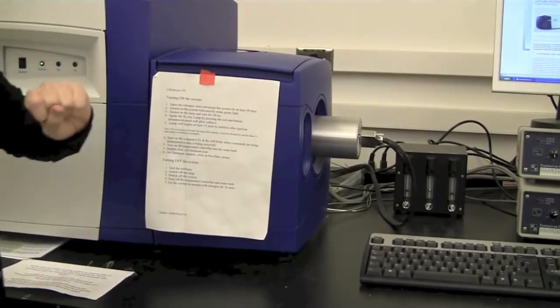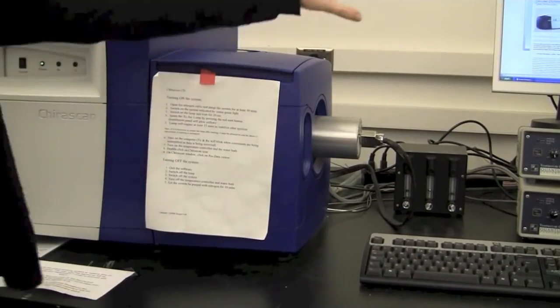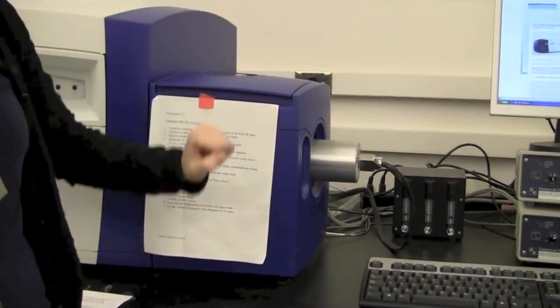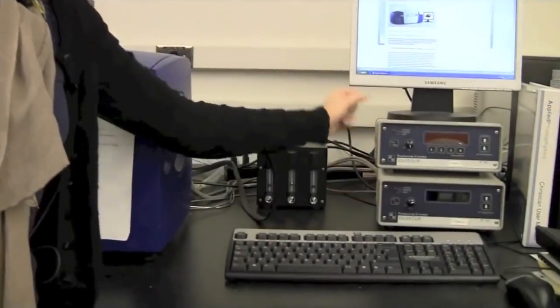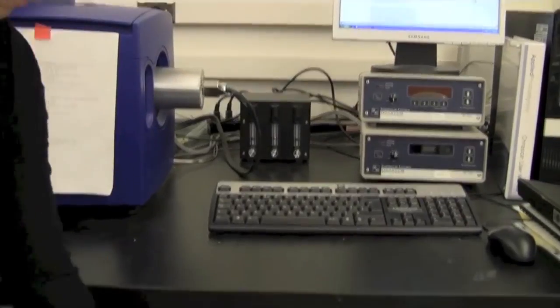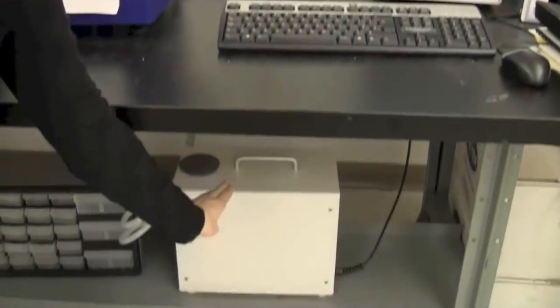Then on top of that we have the computer. We have a temperature controller and then you have a water bath down here.